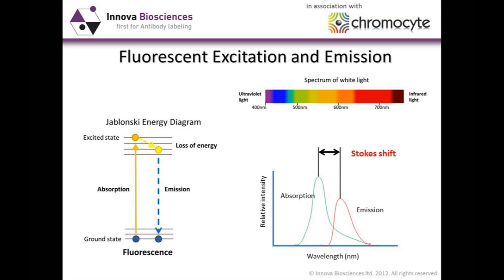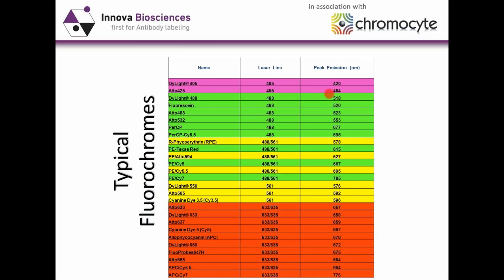So what options are open to you when you start to do experiments? Well, this is just a short list of the currently available fluorescent molecules, and Andy will be going back to this later on. These are the ones which are available through Innova Biosciences.